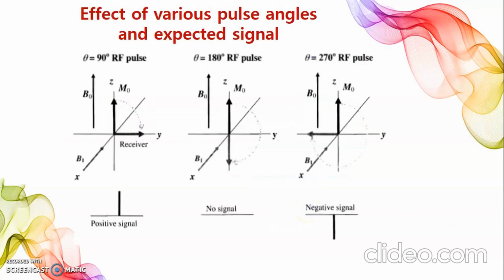The pulsed technique was developed largely in response to the need for much higher sensitivity in carbon-13 spectrometry. A sharp, powerful radio frequency pulse of center frequency mu1 applied along the x-axis covers the entire desired frequency range. The magnetization signals are almost immediately detected after the pulse in the xy plane and collected by a computer over a period of time which is called the acquisition period.